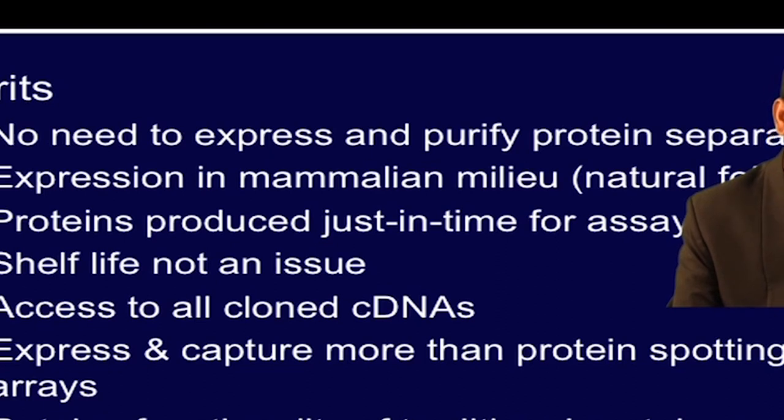If you purify your protein, print on the chip surface, then you have to ensure that proteins are stored in cold condition, often at minus 20 or minus 80 degrees. But here you can store your printed slide at room temperature. Any cDNA which you have access to, which contains tag, can be used efficiently here by using NAPPA chemistry, and proteins can be synthesized.